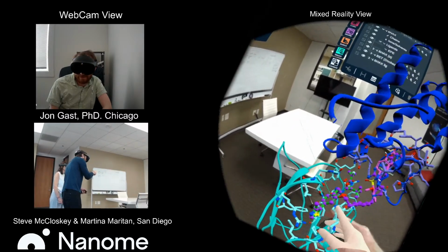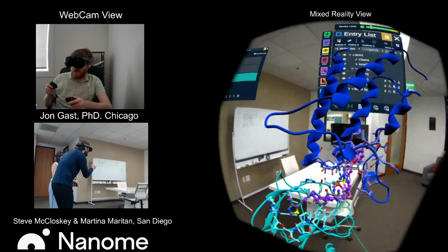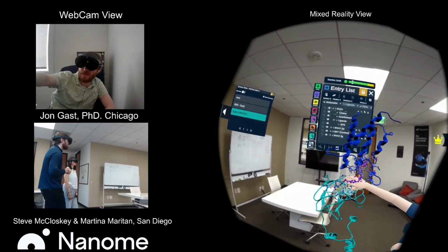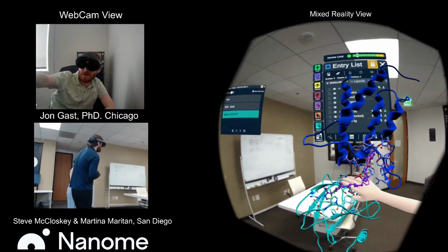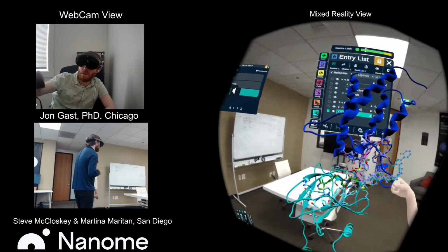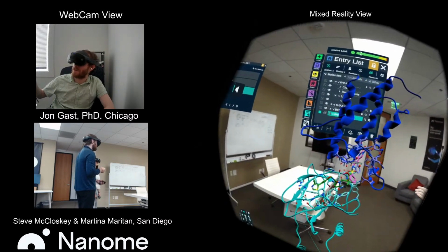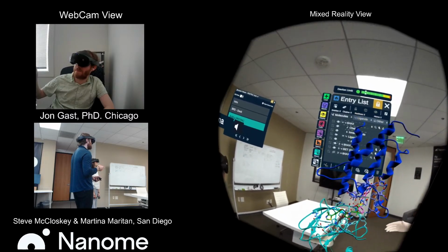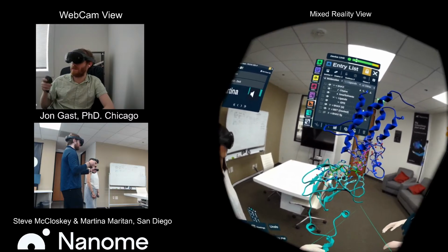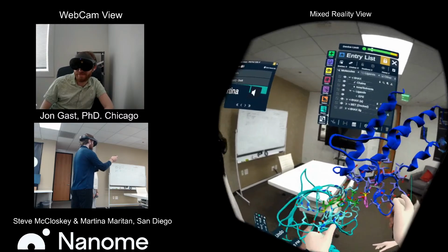John, did you just want to hide some of these so we don't end up having the minimization overlapping? Oh, sure. Right now we're just looking to see how we're able to get a similar vector to where we might connect to the VHL binder. But while we design, we'll always want to make sure our pocket is clear, just to make sure we don't have any minimization issues. So I'll just unlock that. You can lock up here, pull it out, and now it's ready for Steve to take a look at. Perfect. I'm just going to go ahead and take the protein now.